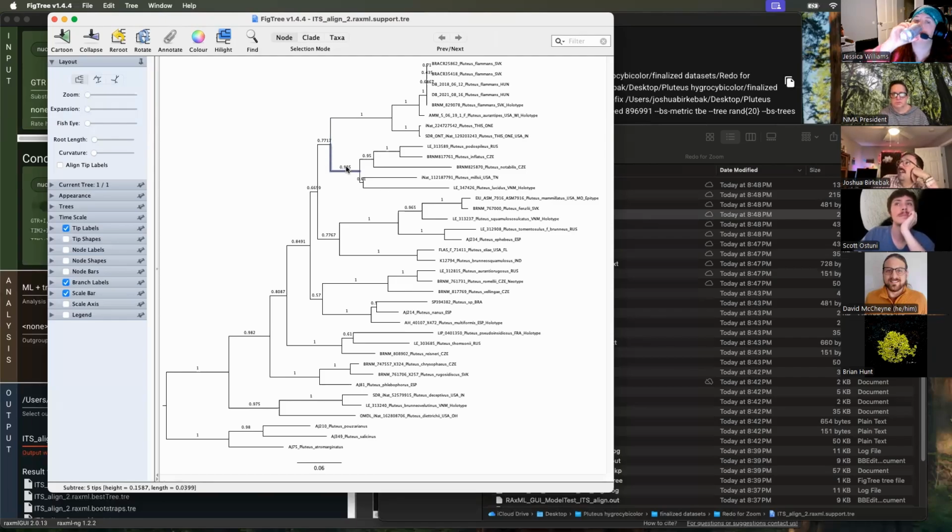We can see that Husto's Pluteus clades also get real strong support. You've got 98 here, one here, one here, one here, one here, one here. We've got strong support for his clades. What we have more middling support on, which is unsurprising given that we only have two regions, is our backbone. This is kind of called the backbone of the tree. We've got some strong numbers. Like I think maybe this Detrichii deceptivus group is a very unique group on its own here. But then we sort of got 80.